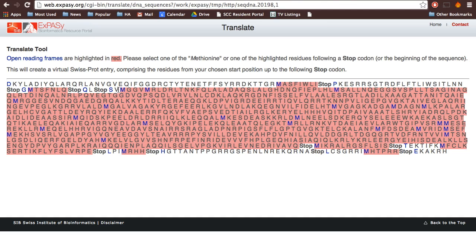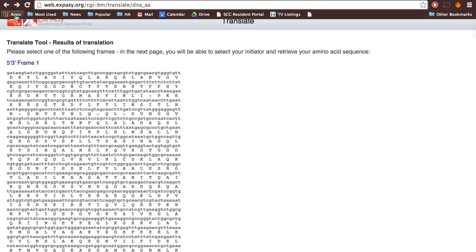Now I can look closely and see that our protein starts with MGGV. So, going back, MGGV right here. I'm going to take it starting from the ATG, which I know to be my start codon, and then I'll just extend it a little.